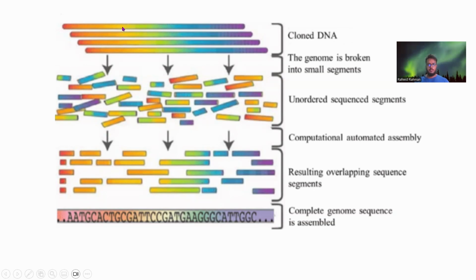So we need to fragment the DNA. Now, if you have a very small amount of DNA, then you need to clone it multiple times. There are procedures for that. After doing that, you need to fragment the DNA into small pieces, and different sequencing methods do it differently. Now your main task in sequencing is to understand which fragment, these are small fragments, contains which string. What is the ATCG string here? That is what we need to find out using the sequencing platform.